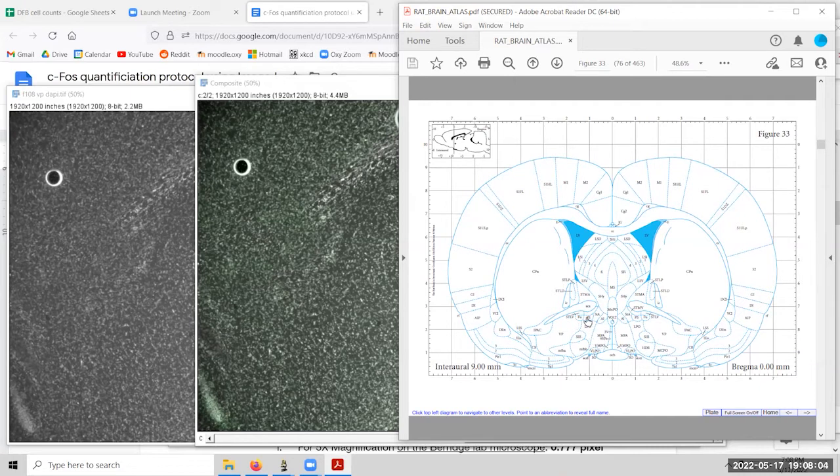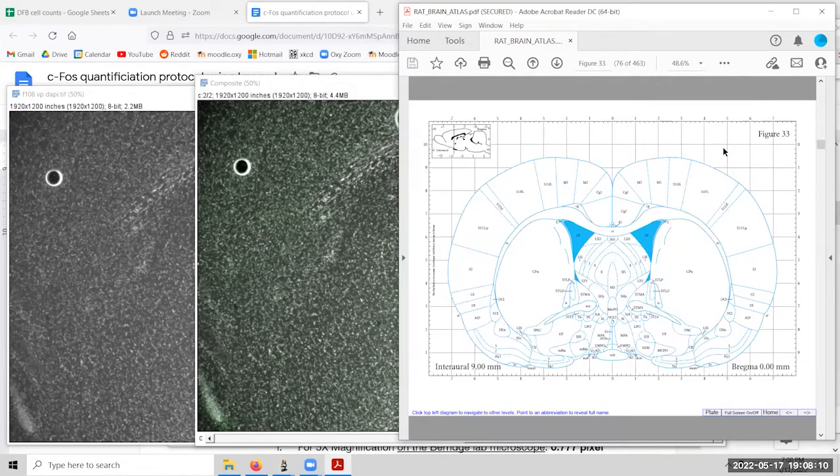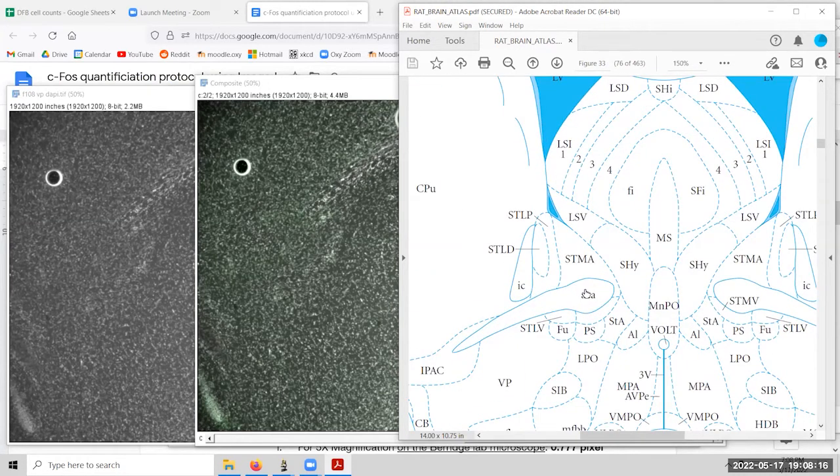So the strand that we see here is actually similar. Well, it's the same thing as the ACA right here. So you can actually start to see this shape where there's an oval attached to a long tail, the anterior commissure, what it turns into as we go further back in the brain.